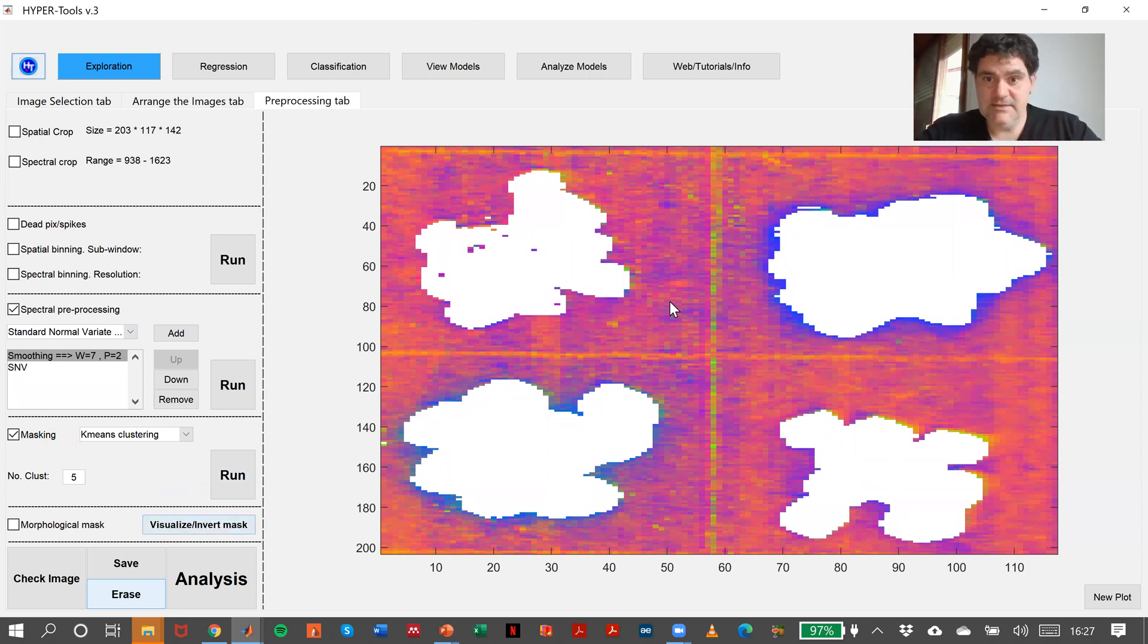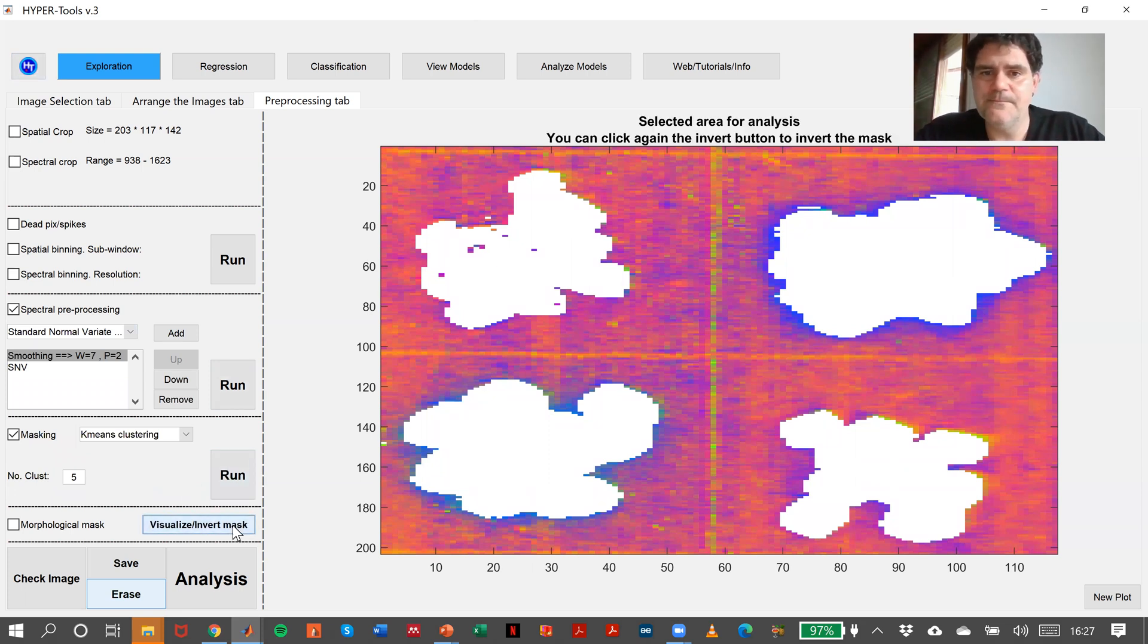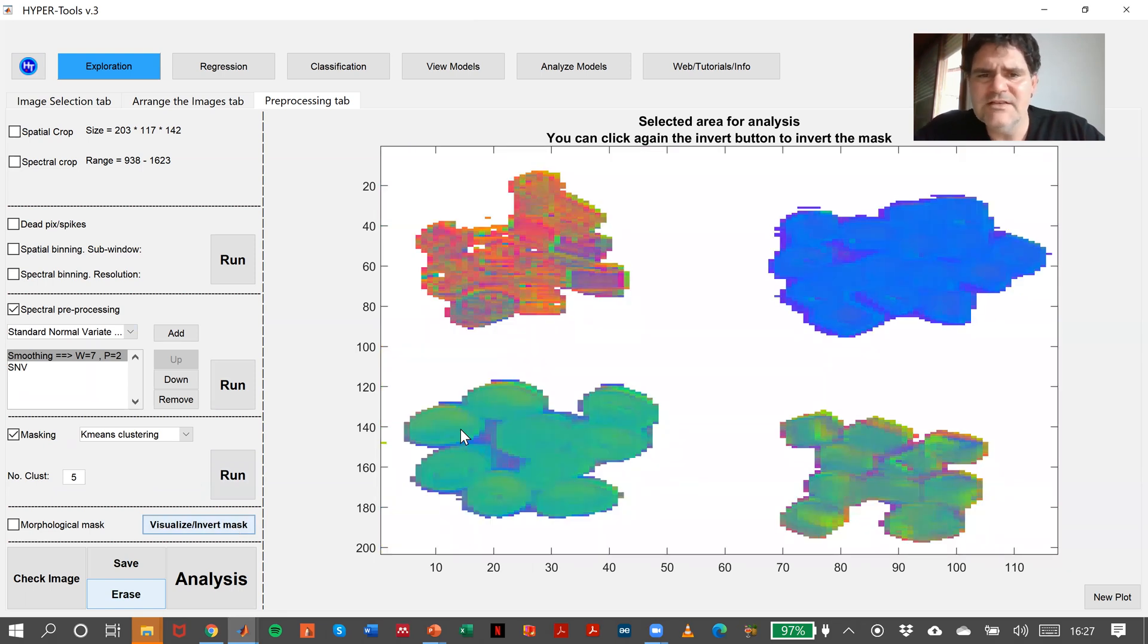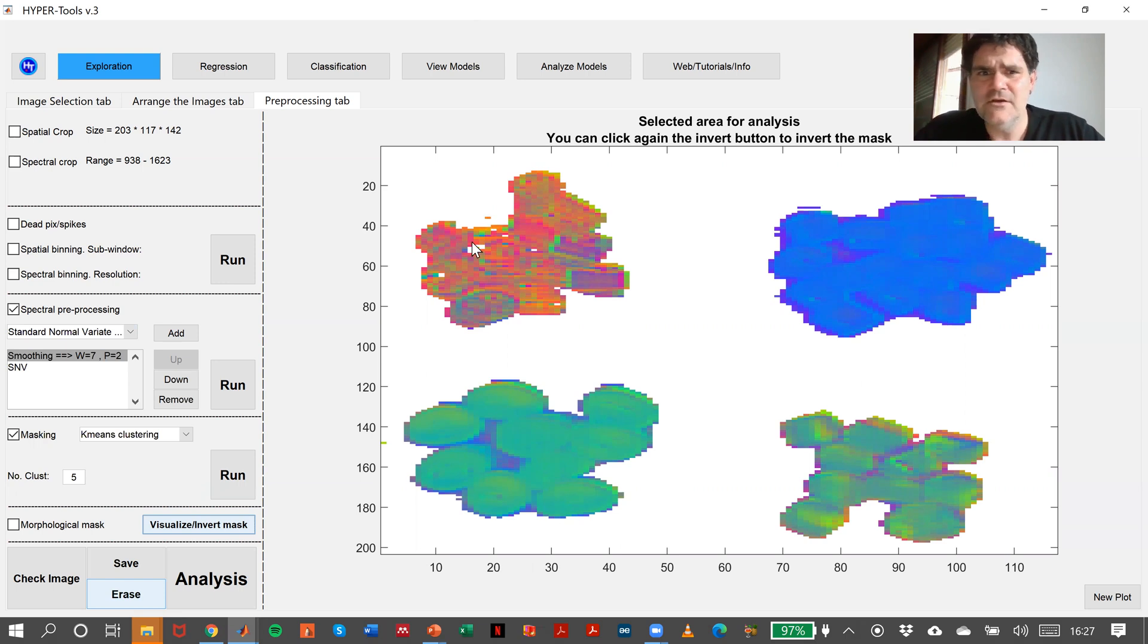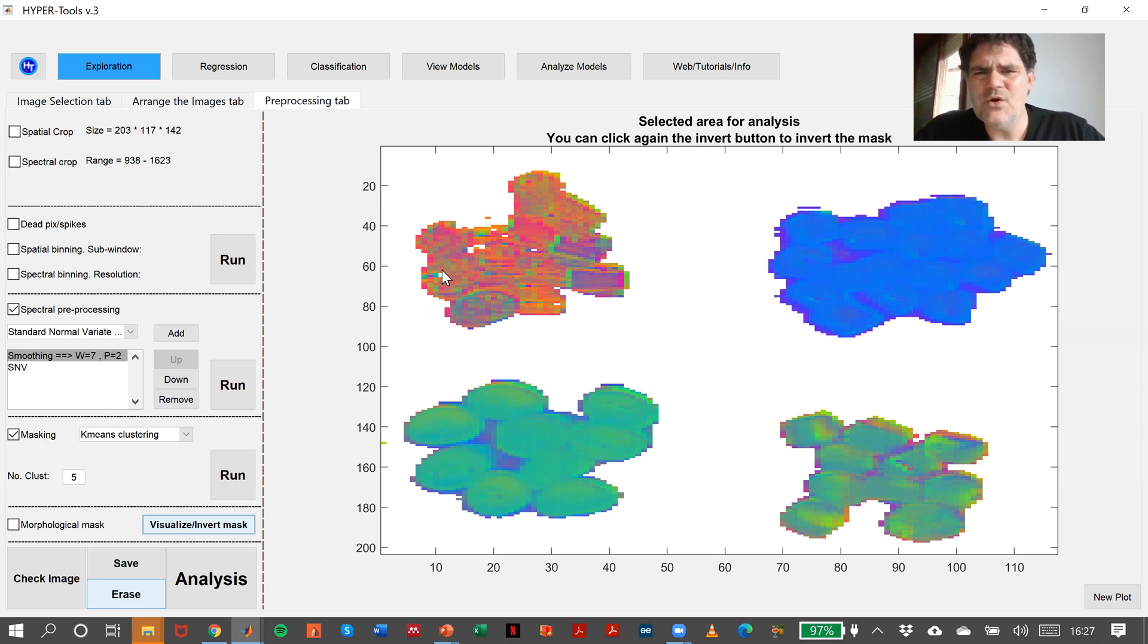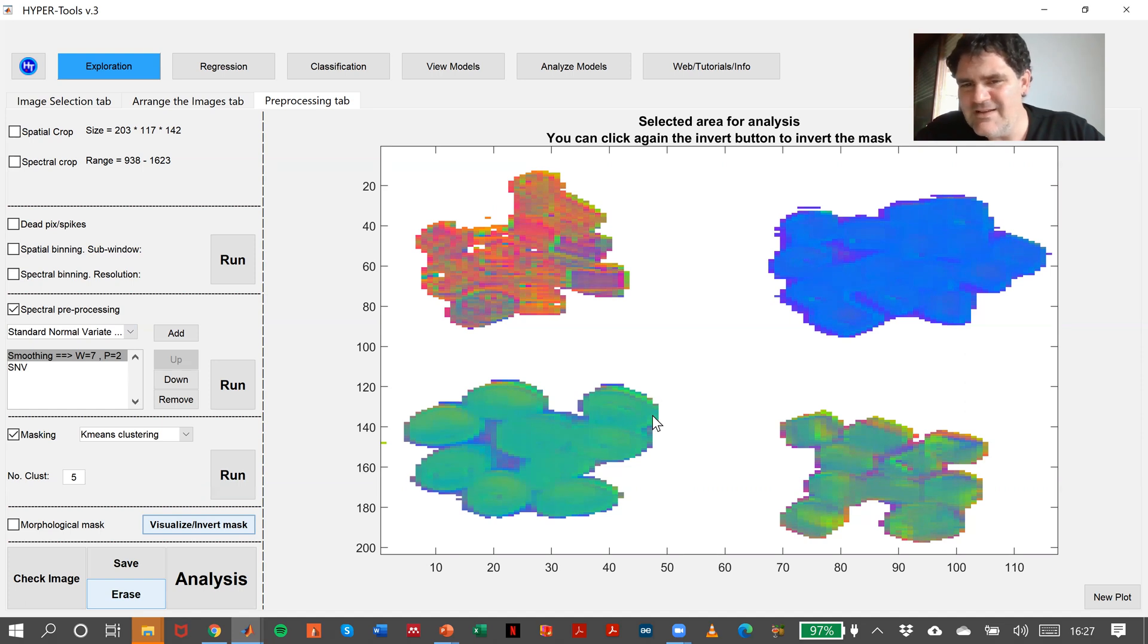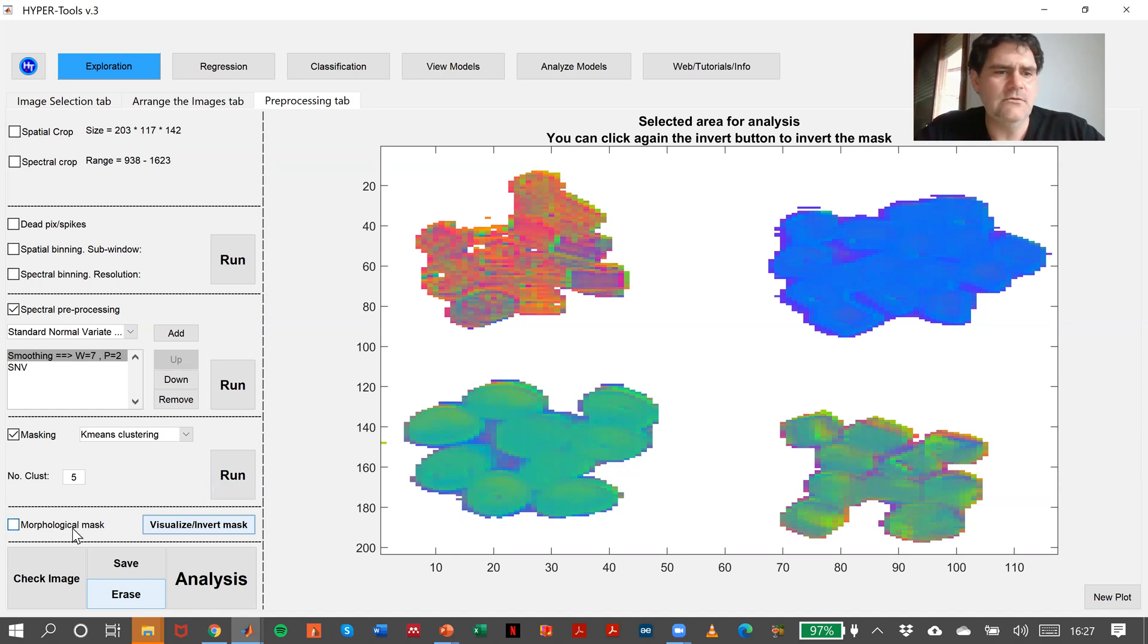Here we are. This is the background, but I want to analyze the inverted part. You can see there are some pixels here outside or there are also these pixels left outside. What I will do is include these pixels and remove these ones, and at the same time, make a little bit of scratching here. So, morphological mask.